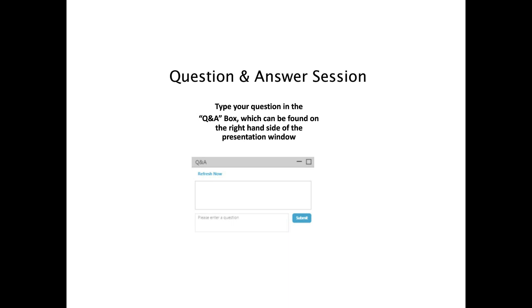So the total runtime was about 15 minutes. That was with the APC application. And this was compared to the standard chromatography where the runtimes are around an hour. So it's much faster than the standard chromatography. So you still get the benefits of using the APC speed.